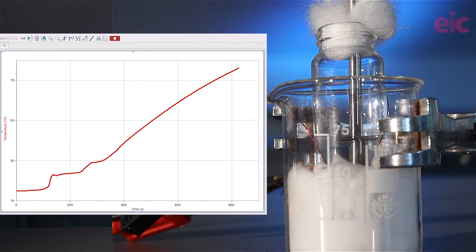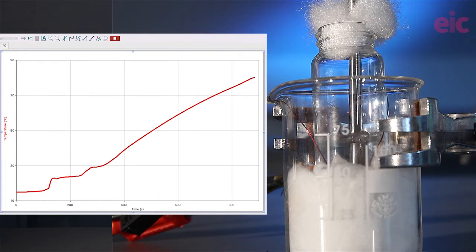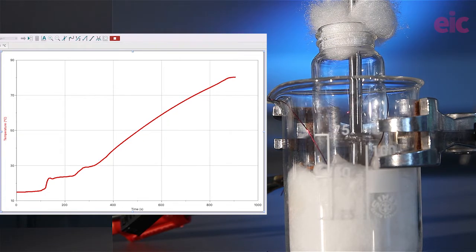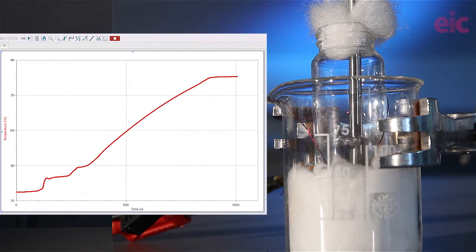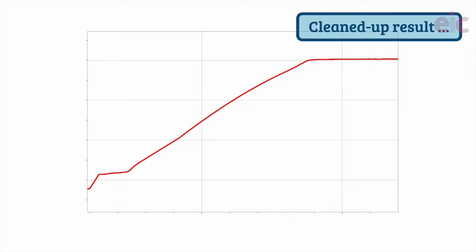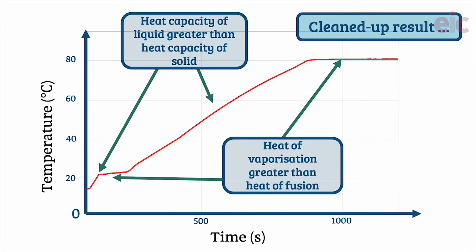After a few minutes of increasing temperature the liquid will begin to boil at approximately 83°C and the temperature will plateau. Leave it boiling for long enough to establish that this part of the heating curve will continue for a substantially longer time than the melting requires. As melting leads to a relatively small change in inter-particle separation compared to vaporization, it makes sense that the latter process would take more time if heating under constant power.